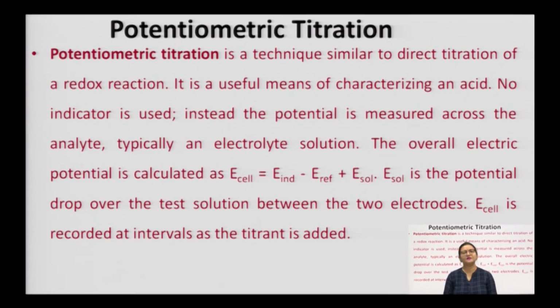The endpoint simply commences with a drastic and sudden change in potential difference which comes along with the titration, as the endpoint shows in the titration, which can be measured easily with the potentiometer. Okay. The potentiometer shows the fluctuation in the potential or voltage difference along the analytical solution in which it is being dipped.